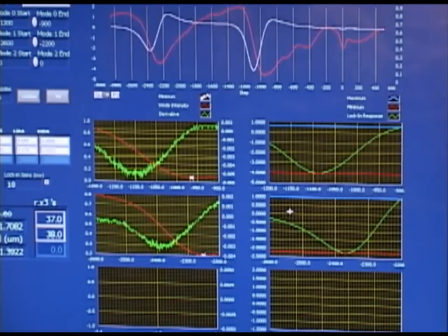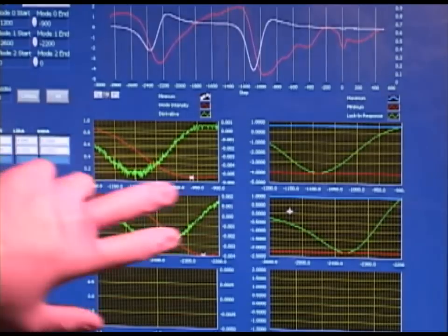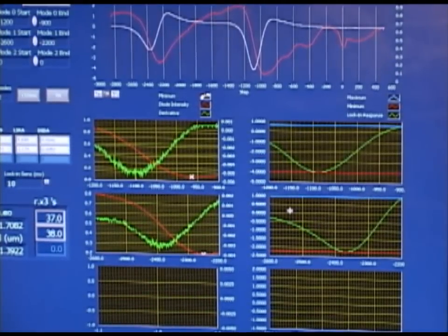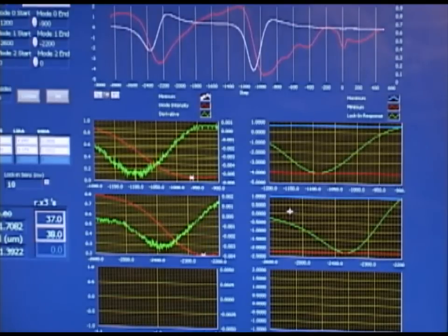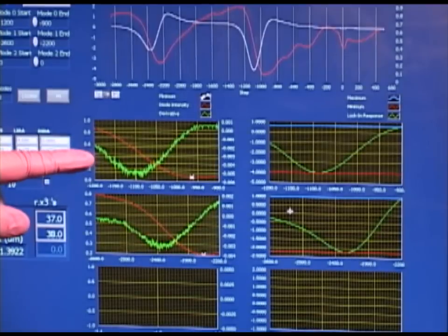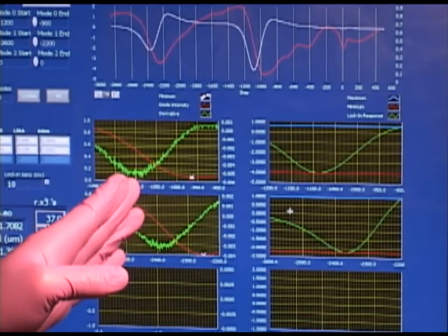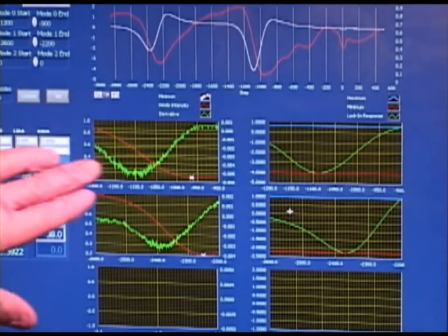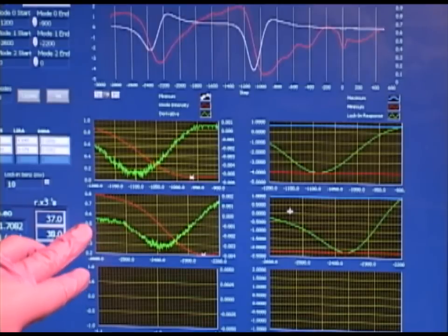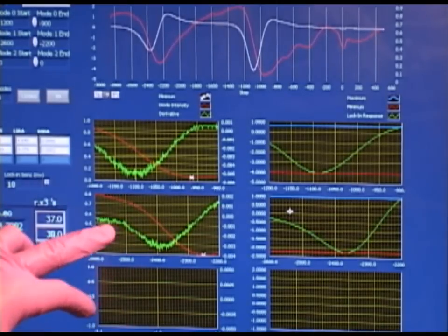Now that we have selected starting and ending points for our two modes, graphs will appear in these boxes below. The left hand side shows green traces of the derivatives of the diode intensity for the first and second modes, and the right hand side displays green graphs of the derivative of the lock-in amplifier response for the first and second modes. We want to fine adjust our two mode starting and ending points so that we catch one full amplitude of these derivatives. Looking at these graphs, we can see here that we can move this in to pick up only the lower point and get rid of the excess. Similarly, down here, we can adjust our mode starting and ending point to remove this excess area here.